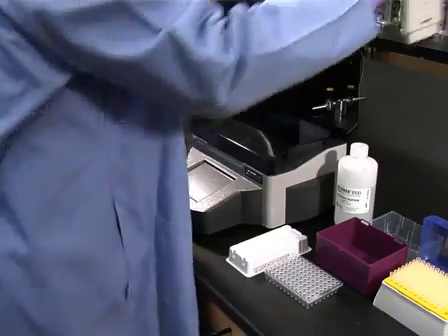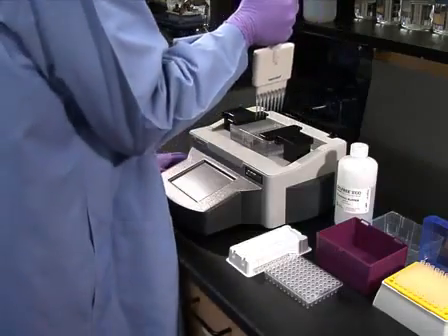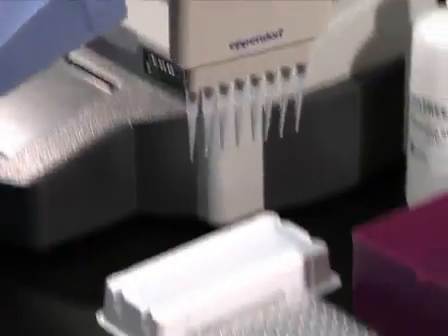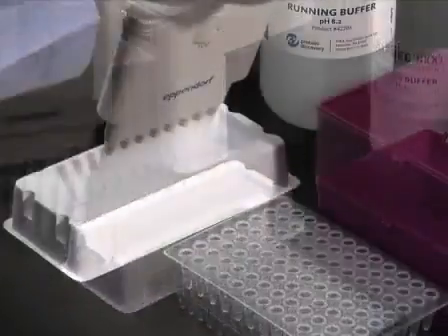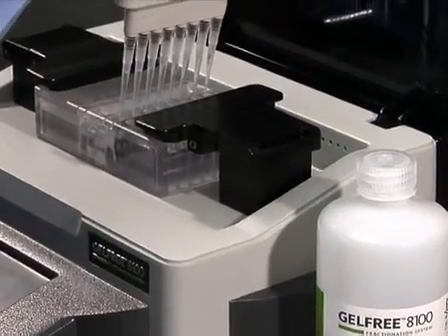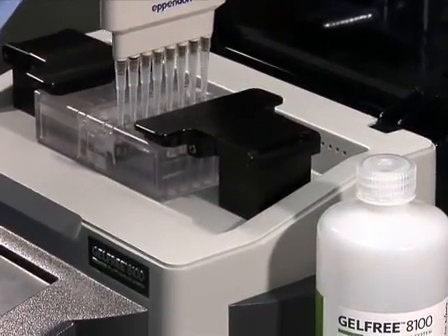To remove the fractions, open the lid of the instrument. Then, using an eight-channel pipette, transfer the 150 microliters of liquid in each of the collection chambers to collection tubes or a multi-well plate. Once the fractions have been removed, wash the collection chamber twice with GelFree running buffer by adding 100 microliters per channel and pipetting up and down twice.